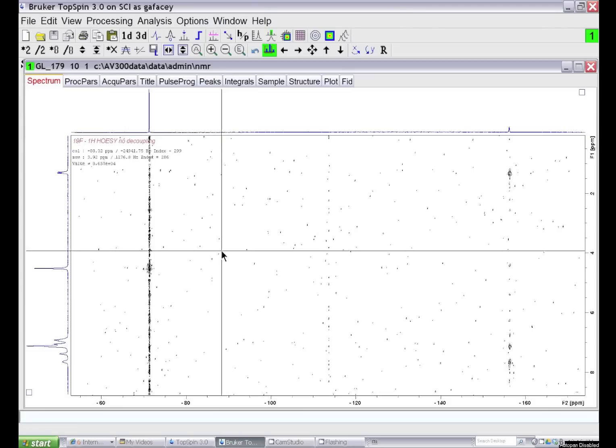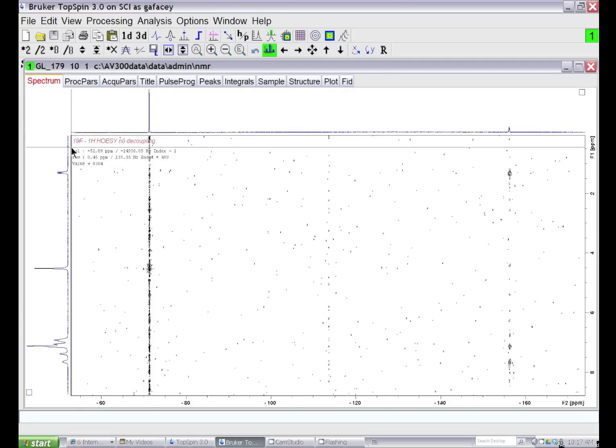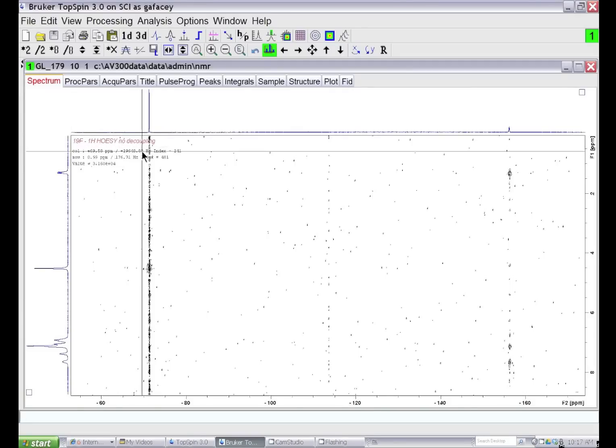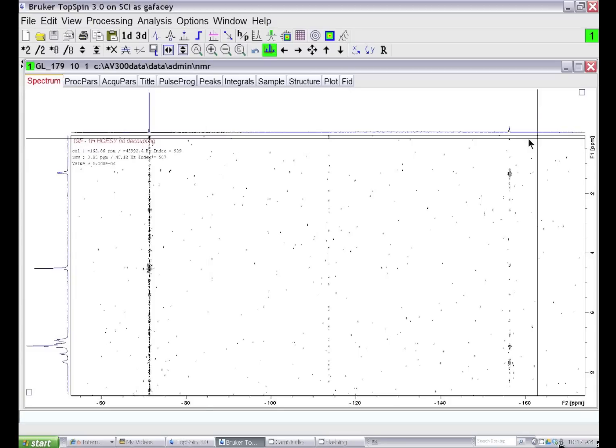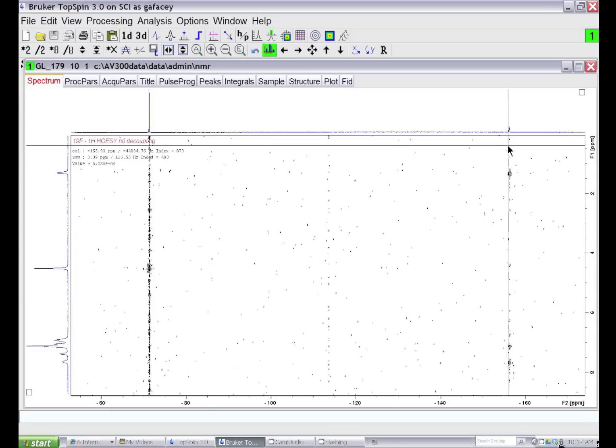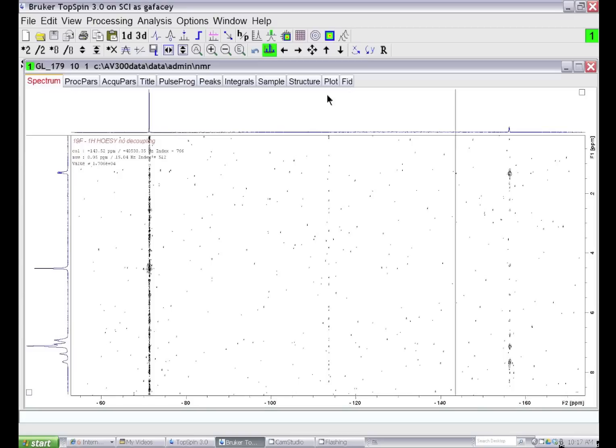I'd like to show you how to remove unwanted T1 noise from a heteronuclear two-dimensional NMR dataset. This kind of noise is typically present in HMBC spectra, or in this case, a fluorine-proton HOESY NMR spectrum. You can see the T1 noise stripes associated with each of the fluorine signals. I want to clean up this noise and make a more presentable dataset.